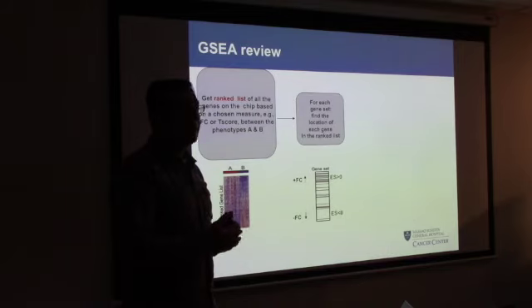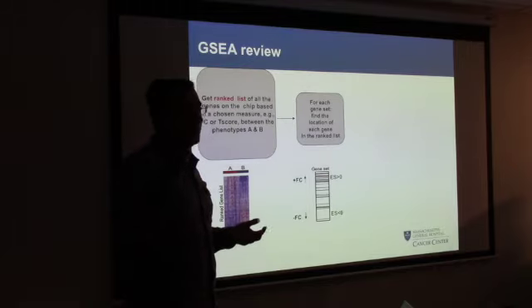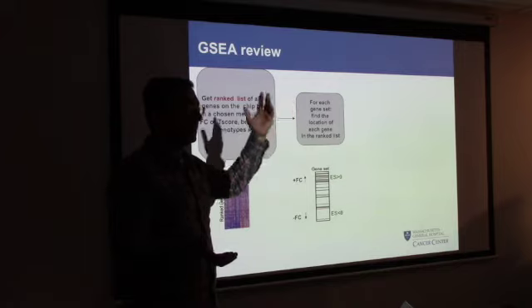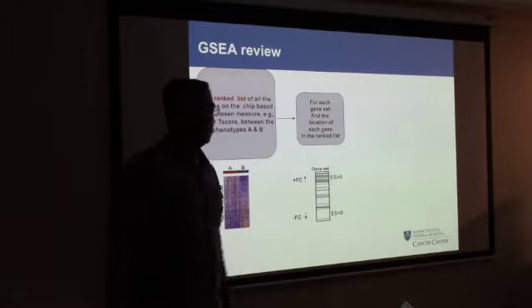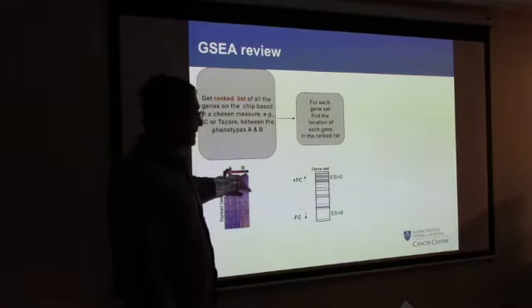Alright? So any set of genes, let's say you have 20 genes that you know are implicated in some paper. You're like, oh, these genes were implicated in breast cancer. Last week I read this paper. I'm going to take this list of 20 genes. I'm going to see how they stack up against my data set for these two conditions.